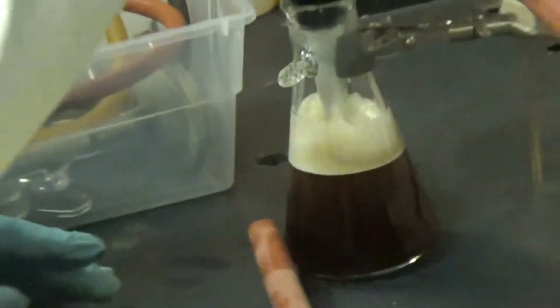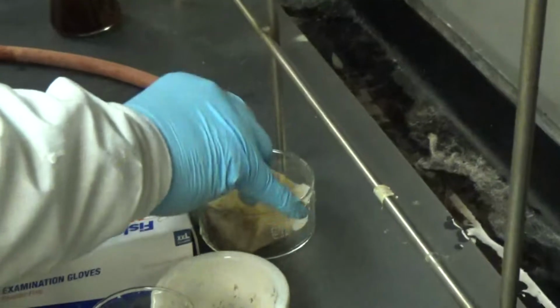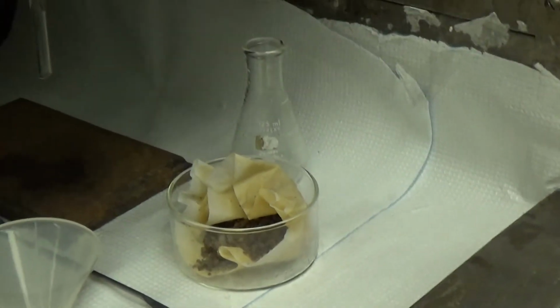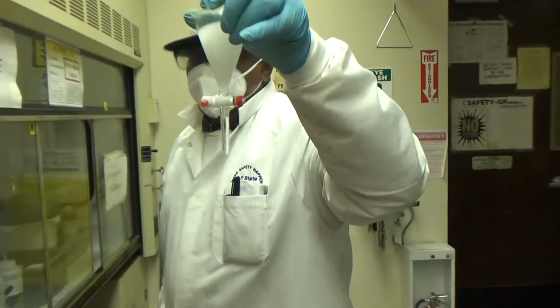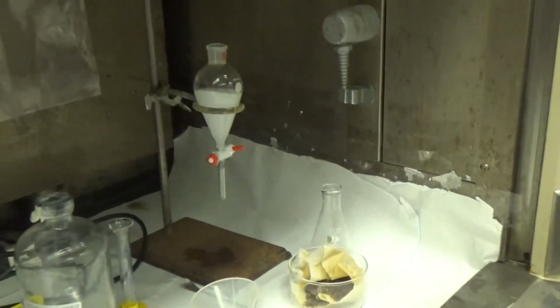And this here, I'm going to put it here like that. Usually if you leave that here, that's not good. Is this like a solid waste? No, it's a container for that. I just put that in the hood, and we're going to collect that. They'll collect that solid waste, the leftover clove waste. You don't have an inorganic waste bottle here, so normally it would go to aqueous waste. Okay, cool.